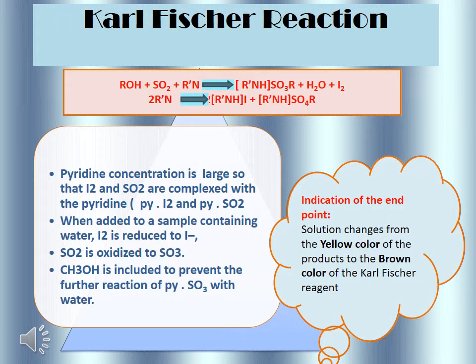Now moving to Karl Fischer reactions. So Karl Fischer titration experiment is performed in two different methods. First is volumetric determination. This technique is suitable to determine water content down to 1% of water, and the sample is dissolved in KF methanol and the iodine is added as KF reagent, and the endpoint is detected potentiometrically. The second one is coulometric determination, and here the endpoint is detected electrochemically. So iodine required for the KF reaction is obtained by anodic oxidation of iodide from the solution.